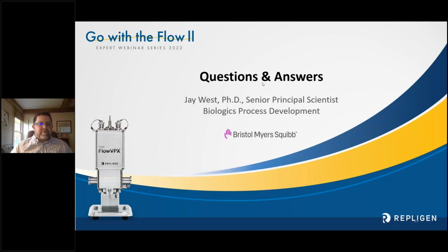the engineers, so-called engineers, or the chemical engineers who are typically the process people, were setting up the PAT instrumentation in the process without a deep background in analytics. I have a chemical engineering background, and I've worked in process at Regeneron. I had that understanding of the process. I wasn't an expert, but I understood that these analytical instruments need to be incorporated into the process, be part of the process, and that they also have to have the same analytical rigor that an offline instrument would have.